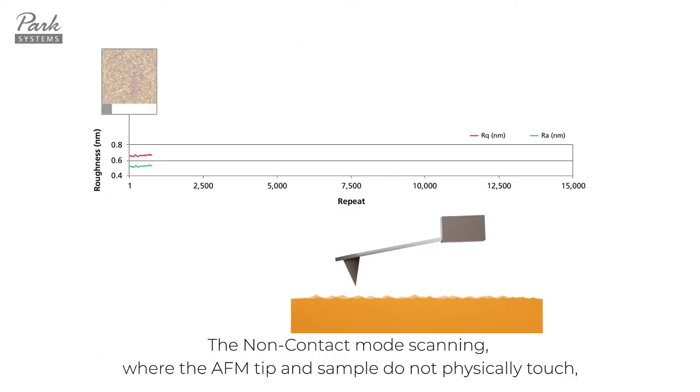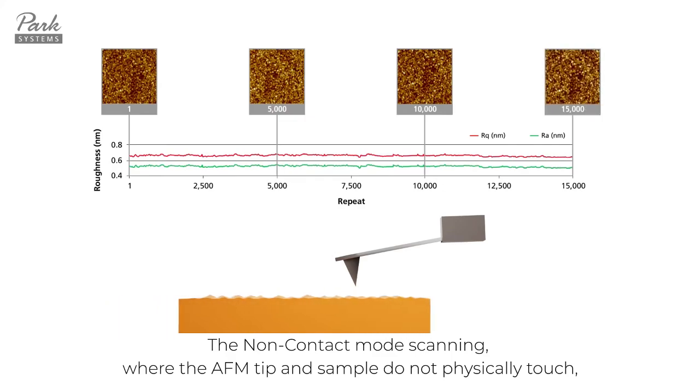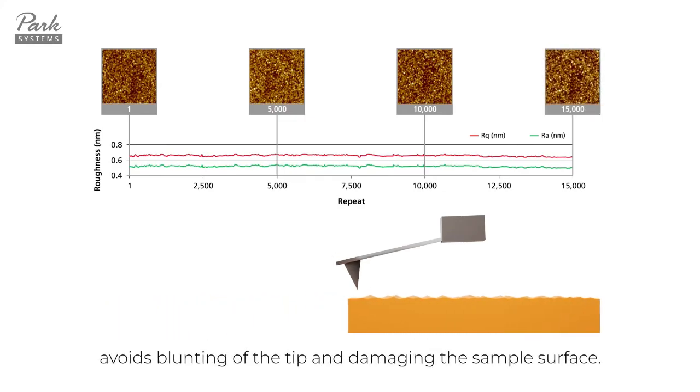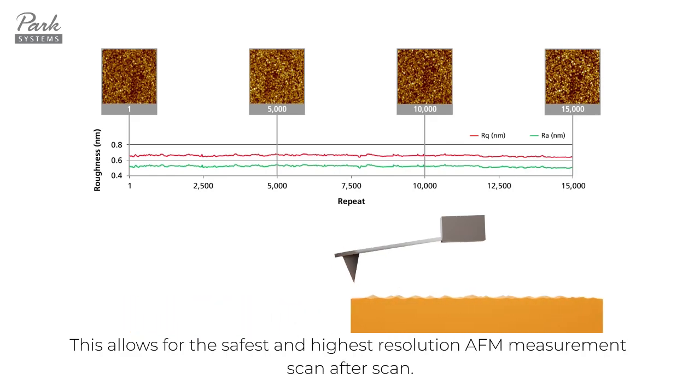The non-contact mode scanning, where the AFM tip and sample do not physically touch, avoids blunting of the tip and damaging the sample surface. This allows for the safest and highest resolution AFM measurements, scan after scan.